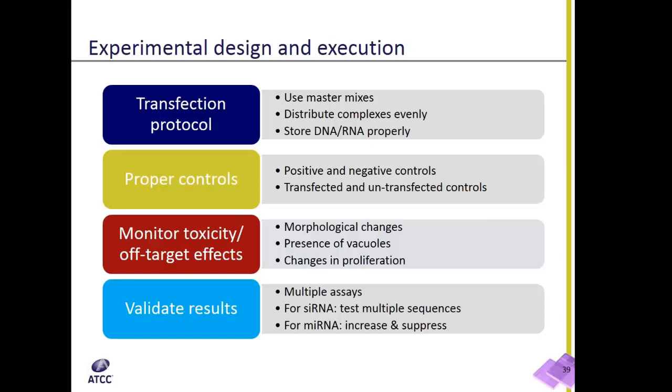DNA or lipids can themselves be toxic, so you should have a condition with only DNA or RNA added and one with only lipid added. Toxicity can show up as cell death or morphological changes. And you should always run your assay with replicates to confirm your results.